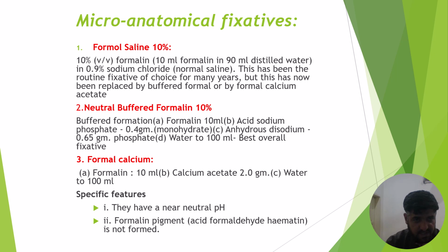The first one is formal saline, that is 10% formalin and 0.9% sodium chloride, that is normal saline. This has been the routine fixative of choice for many years, but it has now been replaced by buffered formal or formal calcium acetate.